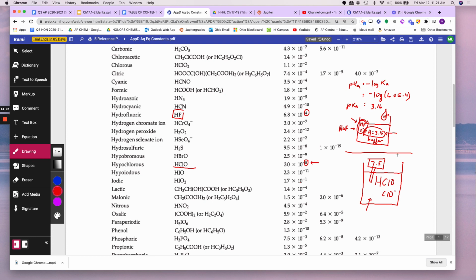So when I add a foreign acid to it, it'll stay at 7.5 until, of course, I run out of stuff inside the beaker. So basically, the more you put in there, the better it is. That is called the buffering capacity. It can react with a lot.